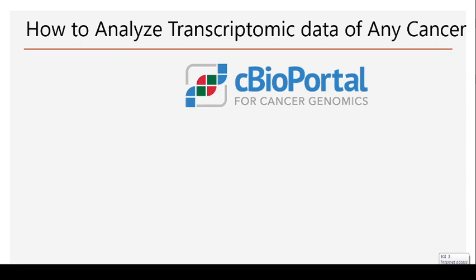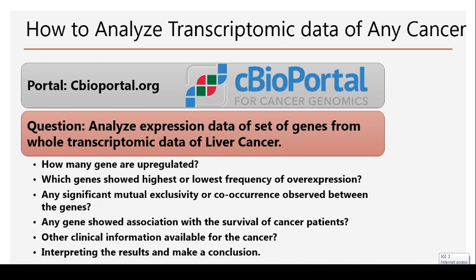So how do you analyze the transcriptomic data of any cancer? Here in this tutorial, I have used the example of cBioPortal. We will go through this whole exercise. The question is: analyze expression data of a set of genes from whole transcriptomic data of liver cancer. This transcriptomic data can be from any microarray or RNA sequencing technologies. After getting any dataset of any cancer — here for example we have mentioned liver cancer — we will try to find answers: how many genes are upregulated, which genes showed highest or lowest frequency of overexpression, and any significant mutual exclusivity or co-occurrence observed between the genes.